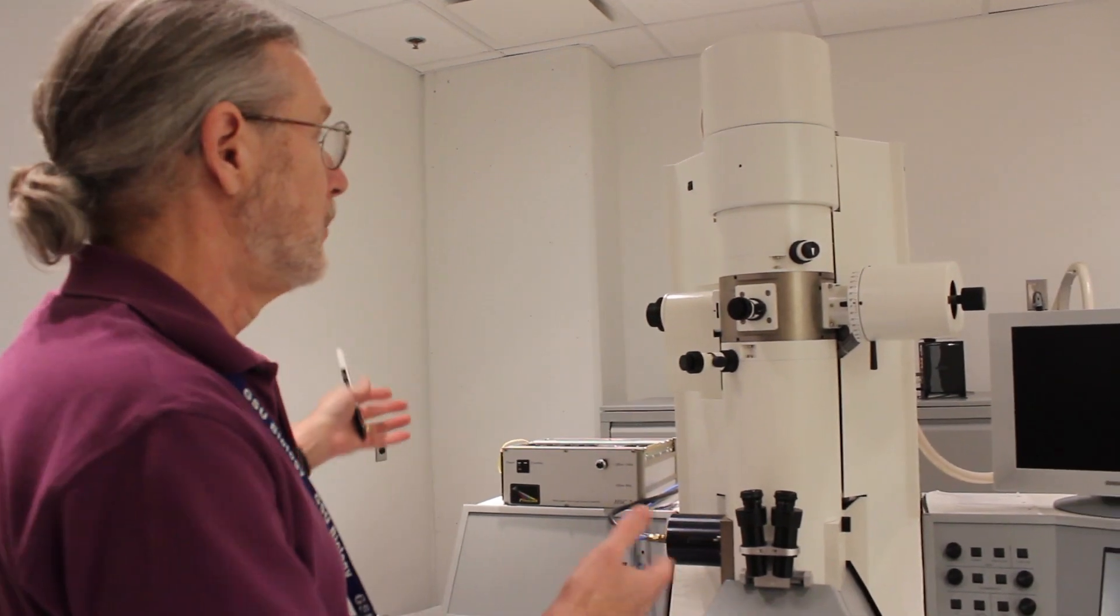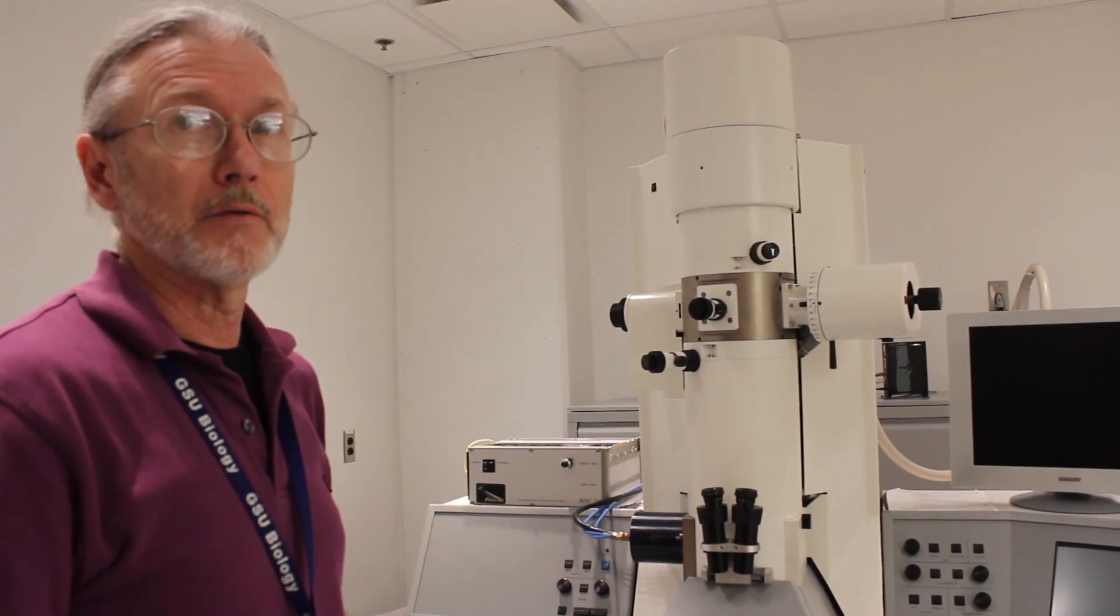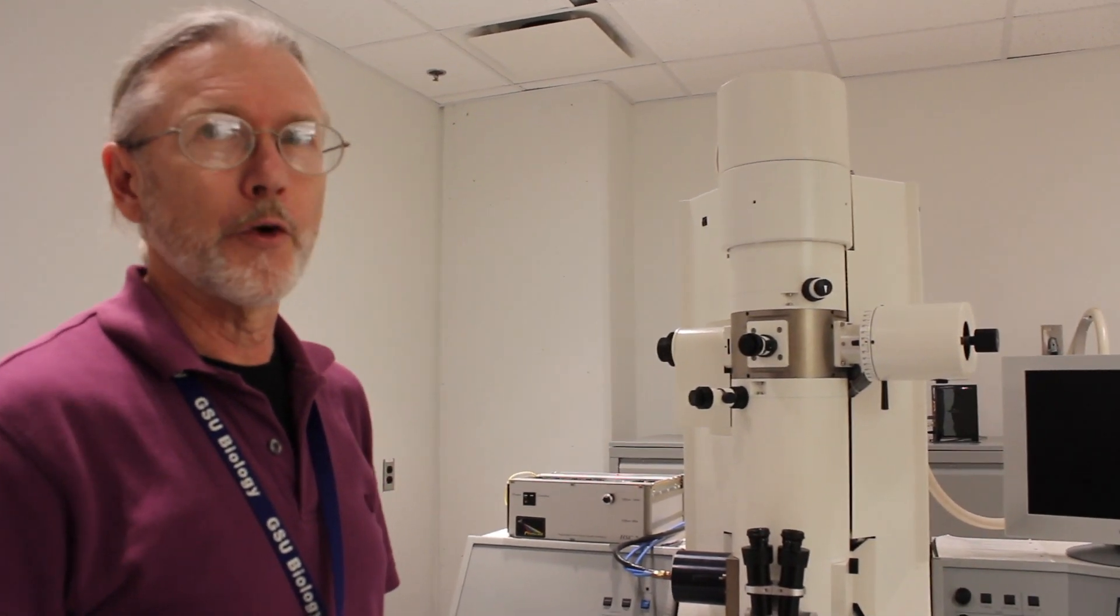So it's about the same noise level as the SEM. The difference in this scope though is you can see it's obviously much bigger. And the maximum accelerating voltage on this microscope is 120,000 volts, whereas that one was more like 10 to... the maximum on that one is 30.